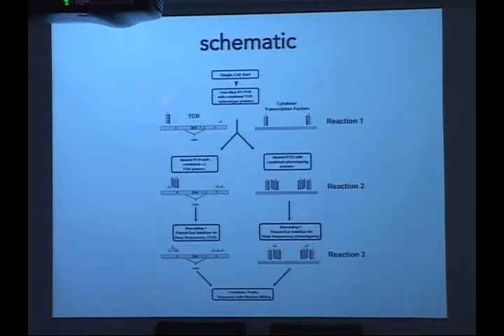It involves a series of nested PCR reactions, which ultimately enable analysis on the Illumina platform. We developed this technology a couple years ago and published a few papers with it, and we got it working quite efficiently. More recently, we thought, well, what about phenotyping cells with the same kind of strategy? So rather than just take the TCRs and sequence them and tell you what the TCR alpha-beta sequence is, why not throw in some cytokine and transcription factor primers and do the exact same thing?